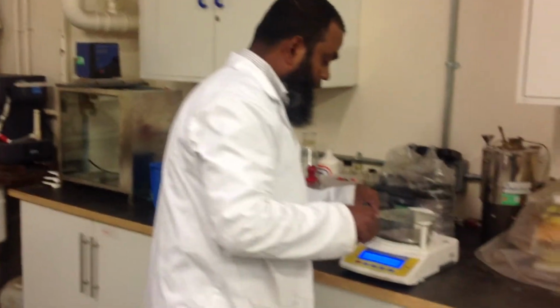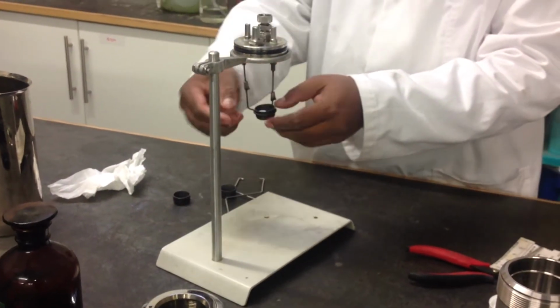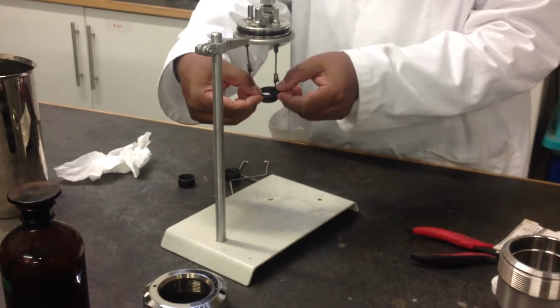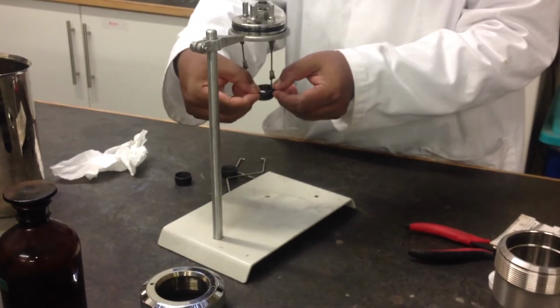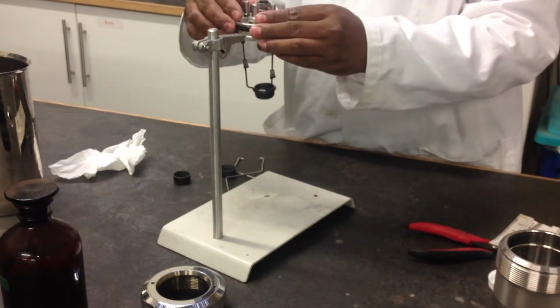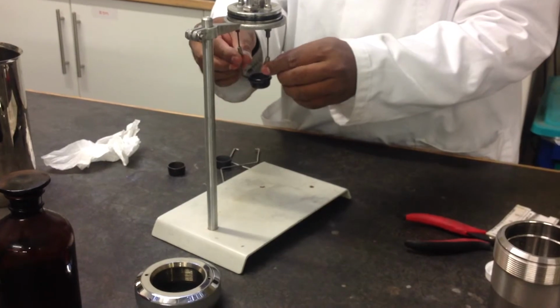So take the sample out of the balance, and then put this sample here in between the electrodes in the loop. Just gently push it down. Don't push hard, gently.